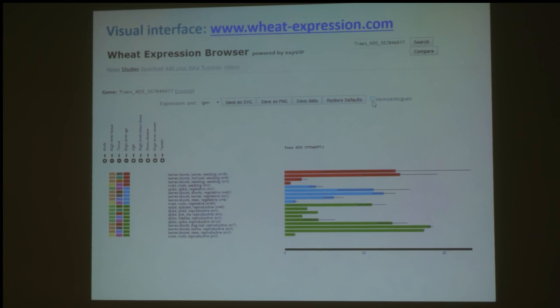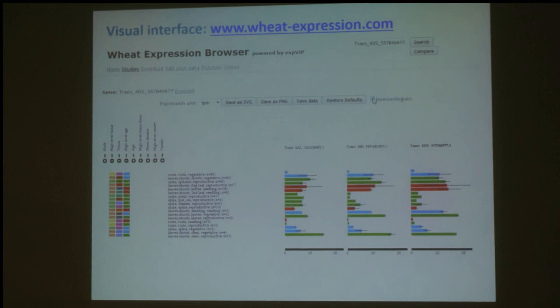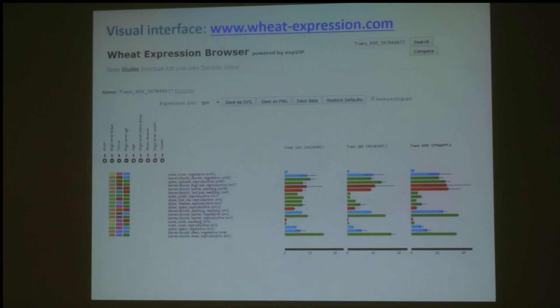Because wheat is a polyploid, we've added an option to view the expression of homeologues. So instead of just seeing the original gene, we now have the expression of the A, B, and D homeologues altogether. In this case you can see that all three homeologues are expressed in quite a similar pattern, but in some cases the homeologues are actually expressed quite differently, so it's interesting to be able to check these things.